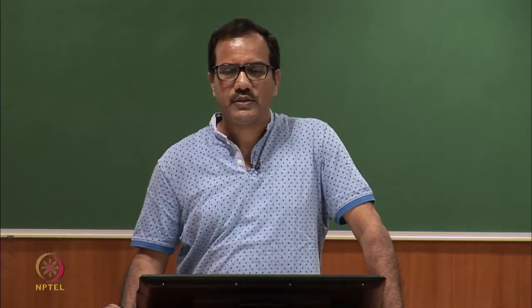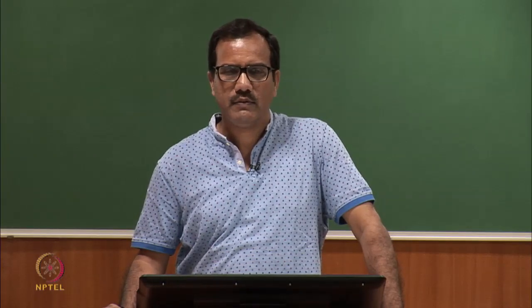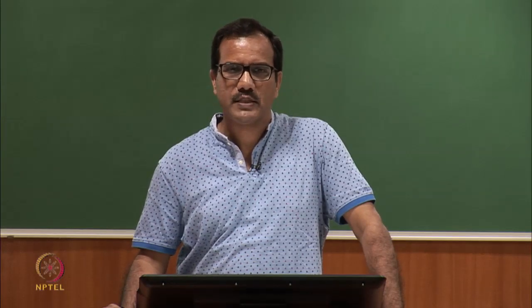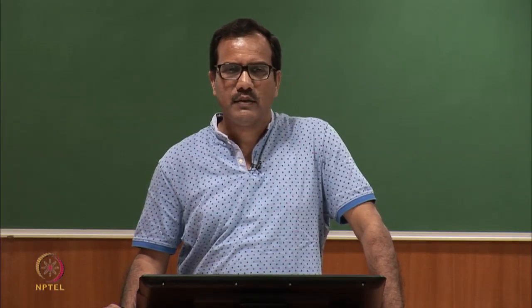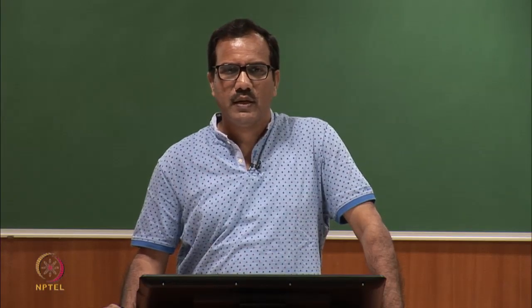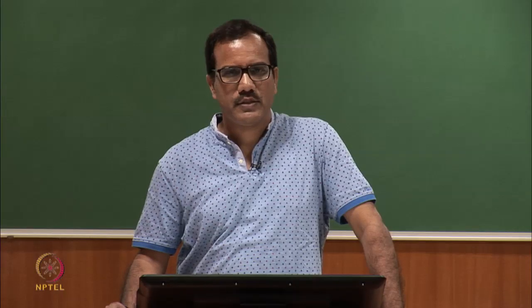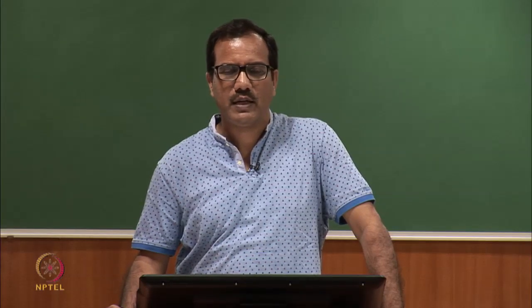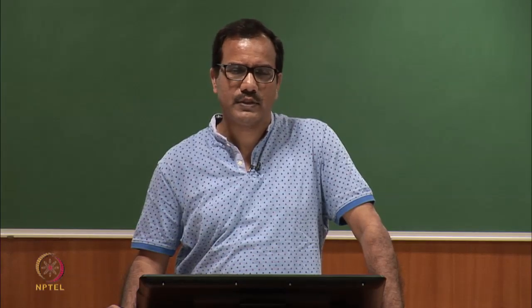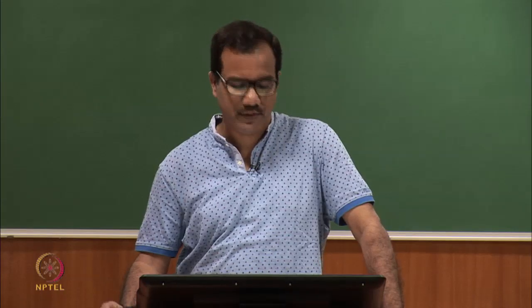During the last lecture I started with the principle of fluorescence spectroscopy. We discussed quantum yield, lifetime and quenching. I will start from wherever I left and I will discuss the applications of fluorescence spectroscopy in this lecture.